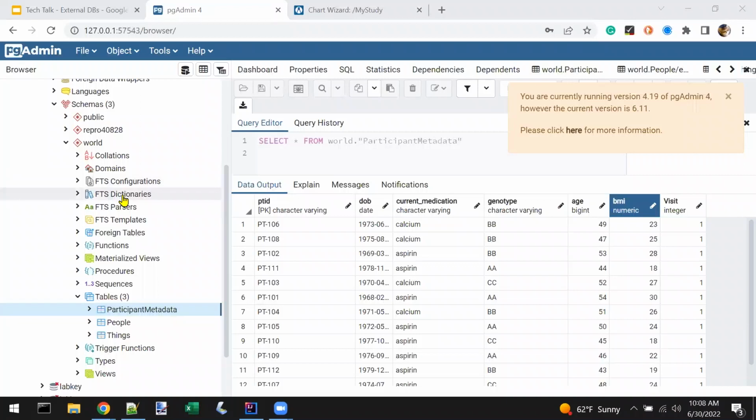It might depend whether it goes offline after LabKey is connected and has seen the tables and thinks they're there, versus it never connected. It might act a little differently. But if LabKey connected and found these tables and they disappear out from under it, you would get some sort of configuration error. Please contact your administrator kind of error, I believe.